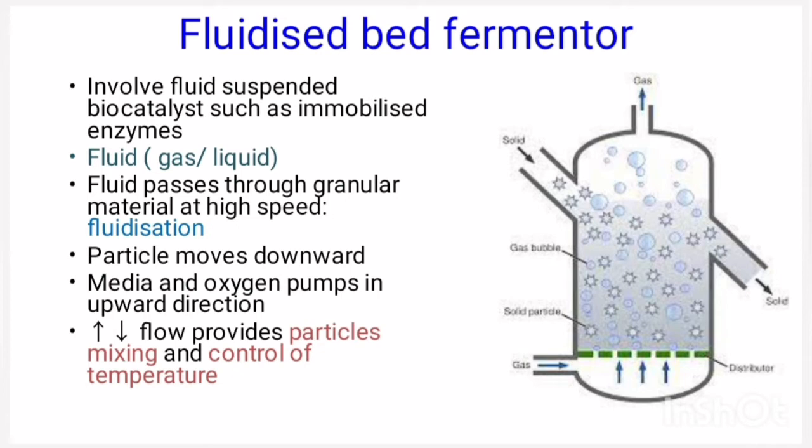Enzymes are immobilized onto solid granular material. The smaller particles move downward due to gravity, so they settle at the bottom. The media and oxygen are pumped through the bottom of the fermenter. So the upward movement and downward movement provide particle mixing and temperature control.